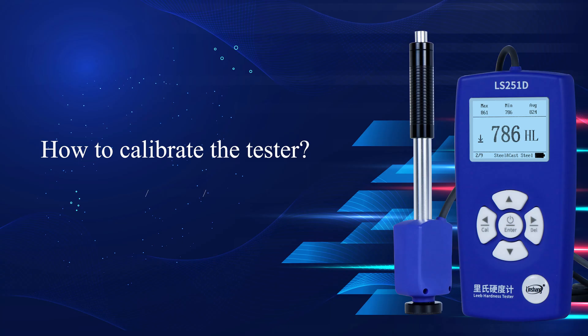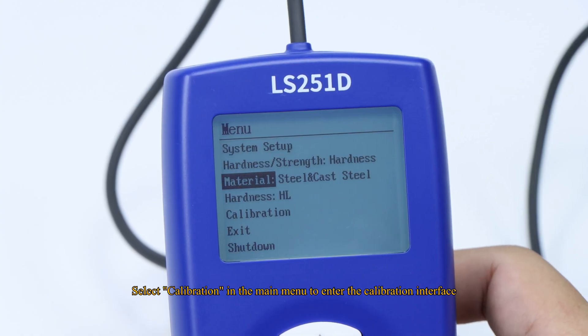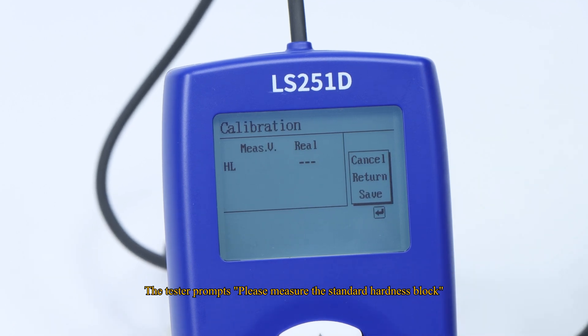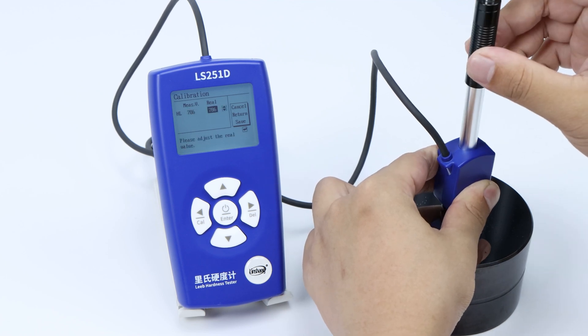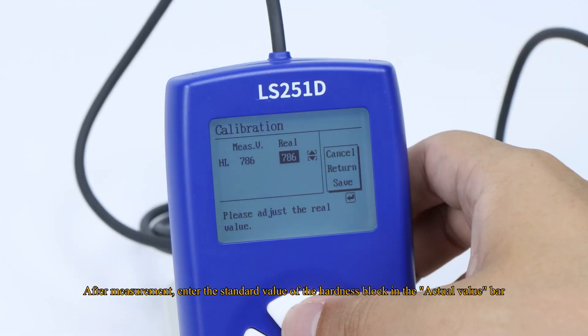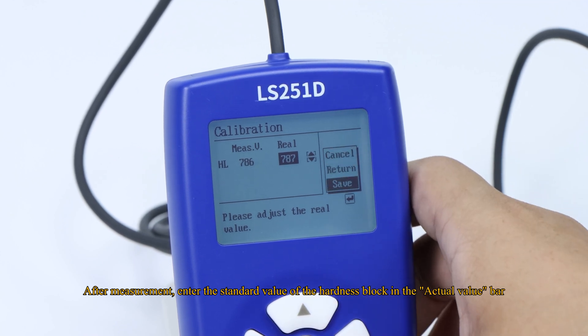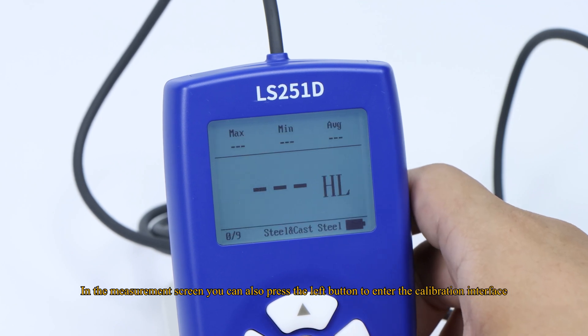How to calibrate the tester. Select Calibration in the main menu to enter the calibration interface. The tester prompts: please measure the standard hardness block. Do as it prompts. After measurement, enter the standard value of the hardness block in the actual value bar and choose Save when finished. In the measurement screen, you can also press the left button to enter the calibration interface.